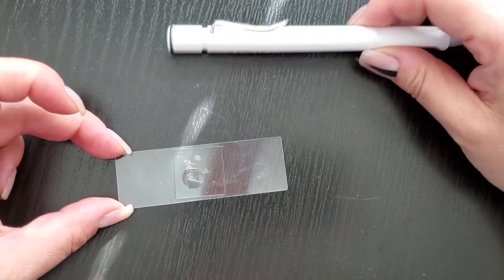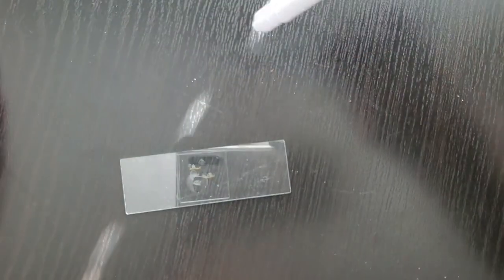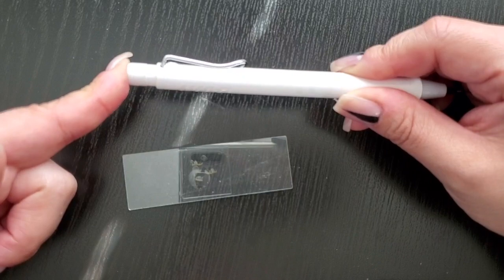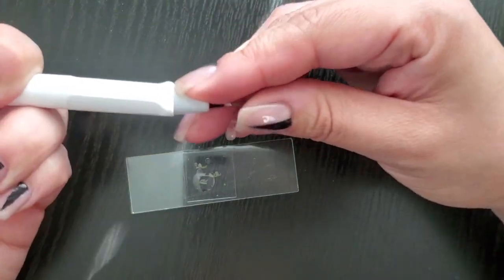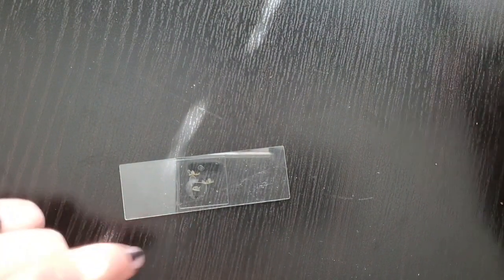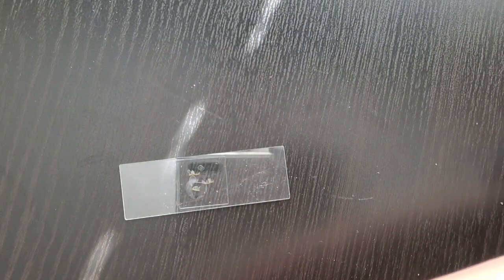And then what I end up using is the back of a mechanical pencil because it has the right pressure. It doesn't let you go farther than that. And it's a pretty good guide. So this one in particular is tricky because I already put oil. So to remove oil, there are ways around it.